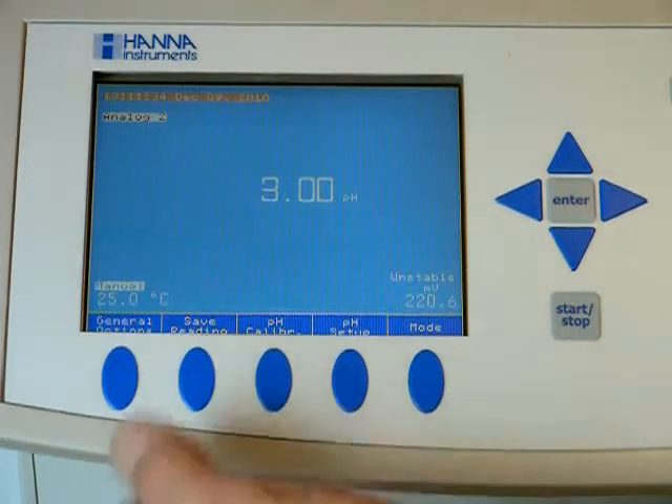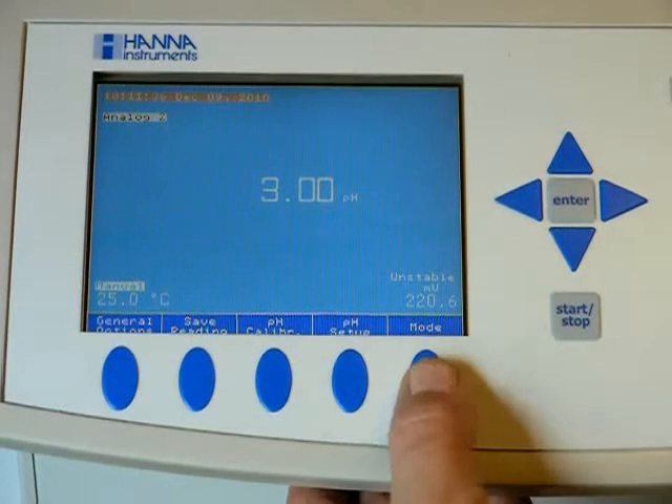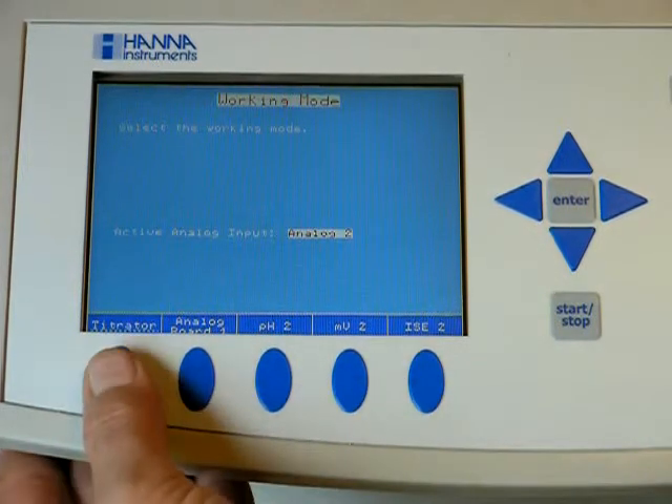Then hit escape, choose your mode, and we'll go back to titrator.